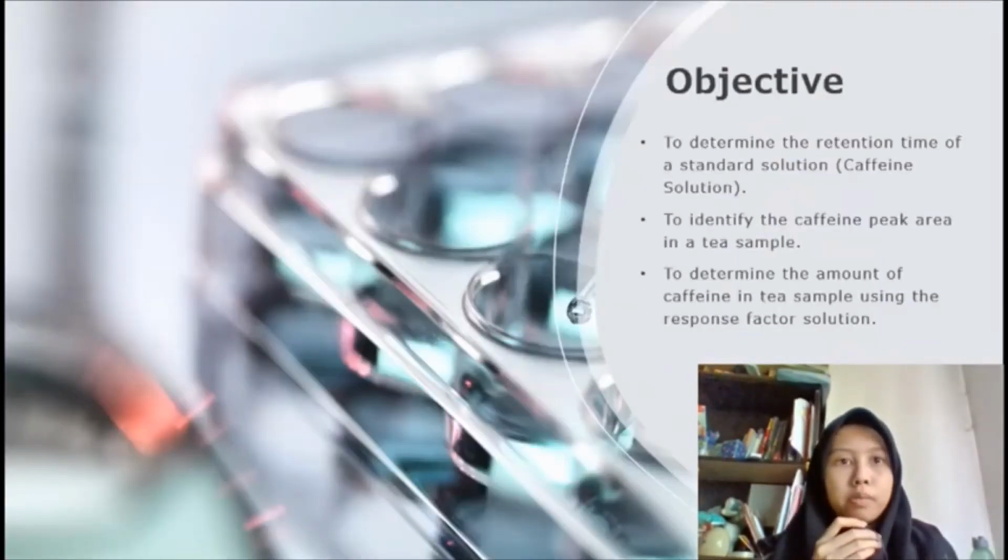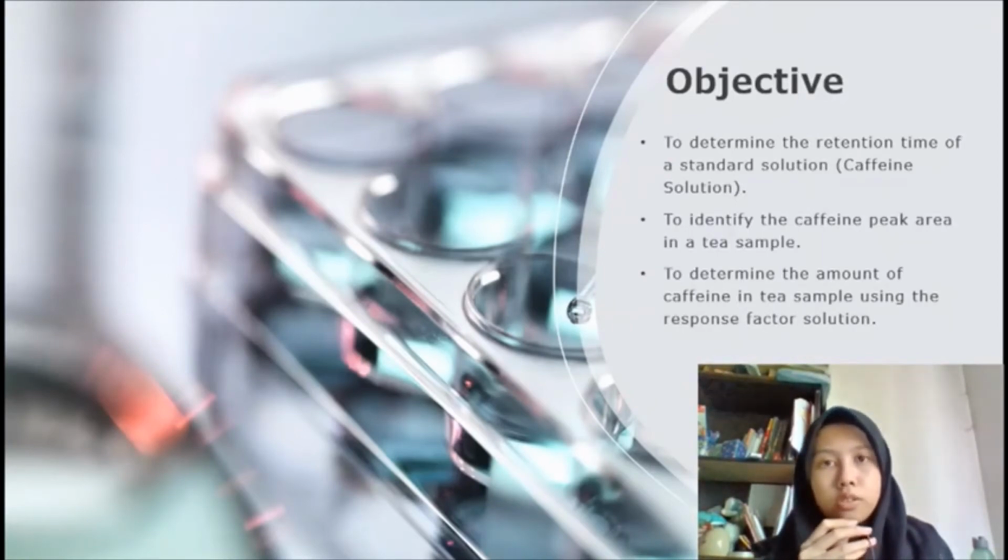For this experiment, we have 3 objectives, which is to determine the retention time of a standard solution, which is caffeine solution, to identify the caffeine peak area in a tea sample, and to determine the amount of caffeine in tea sample using response factor solution.